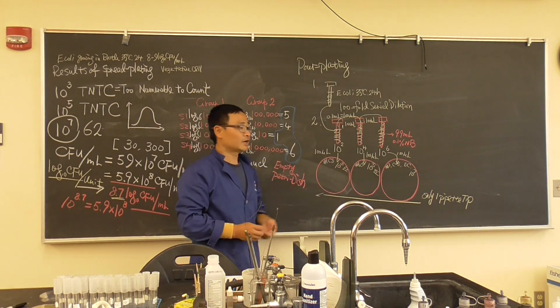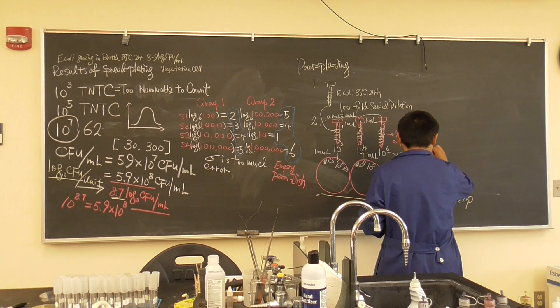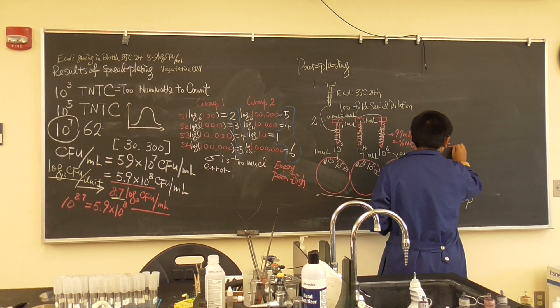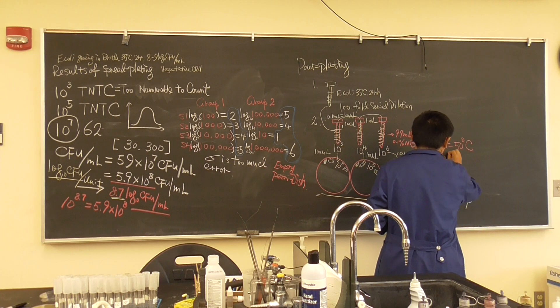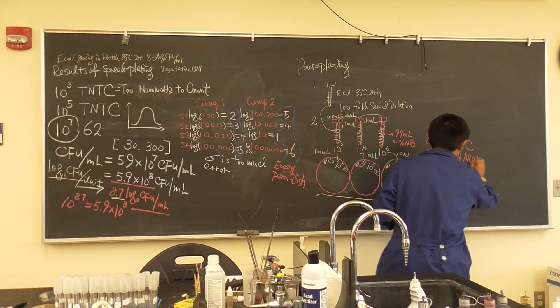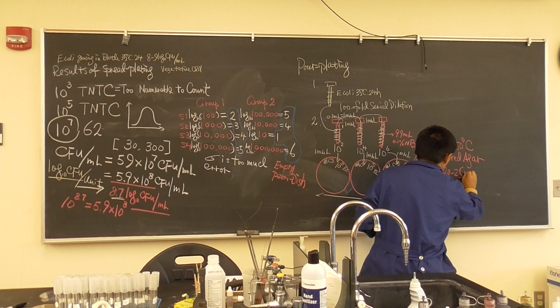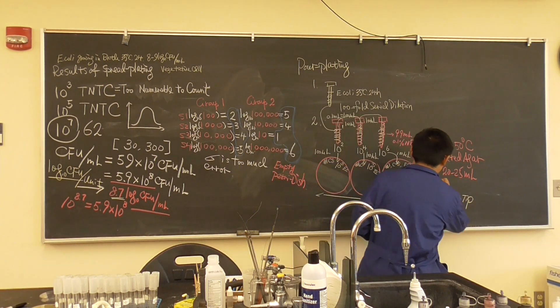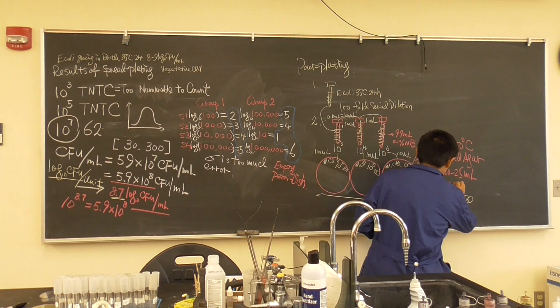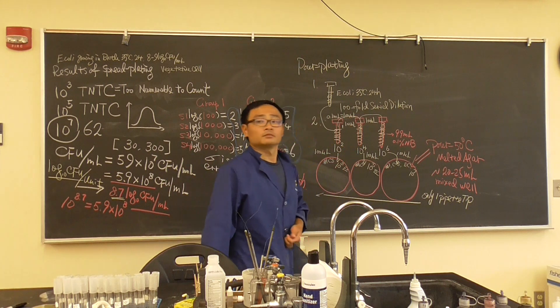After you're adding, what we do? From 50 degrees Celsius, melted agar. Around 20 to 25 ml approximately. Then you have to mix well.